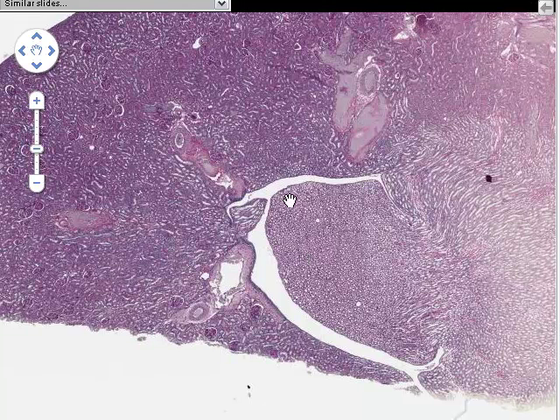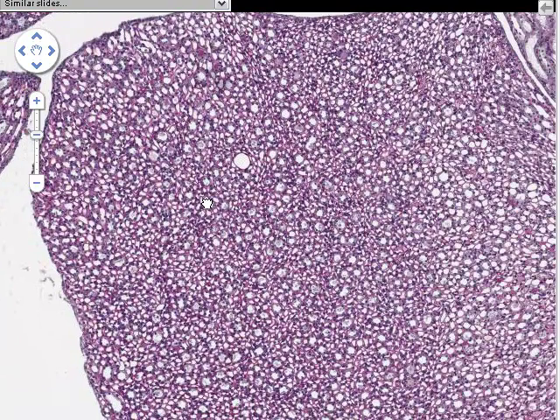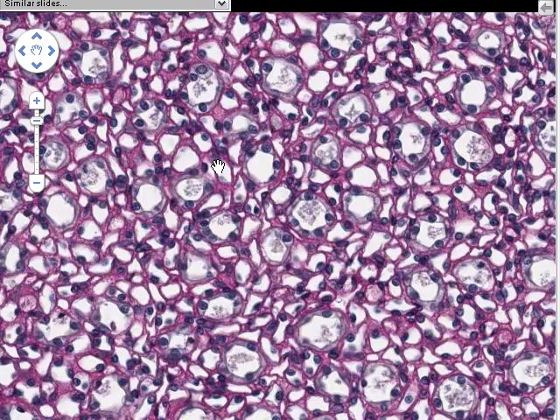Now bear in mind that this piece of tissue is in fact a series of tubes. These ones, rather than being coiled, are quite straight. They're all compressed together, and these tubes have been cut in cross-section. So it's as if we had taken a bundle of reeds and we had chopped across the bundle of reeds, and we're staring now end on at the bundle of reeds or bundle of bamboo. And now we're going to go and take a look at how these particular tubes appear. Here we go. So here, these are our reeds or hollow tubes that have been cut across, and we're looking at them in cross-section.